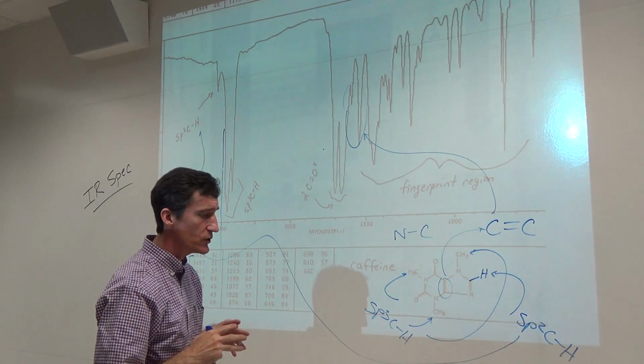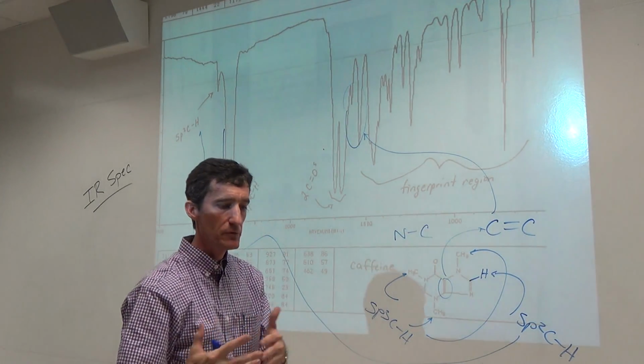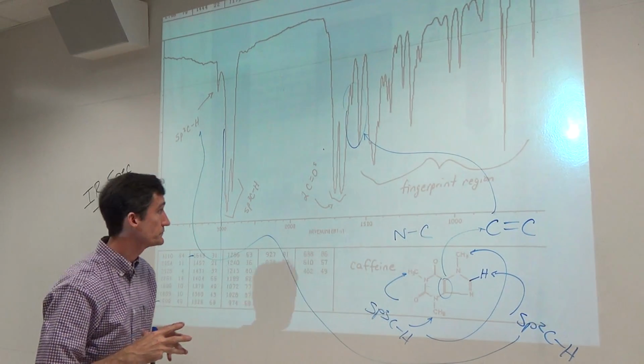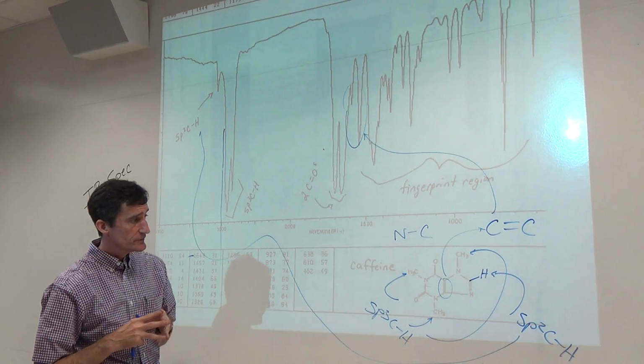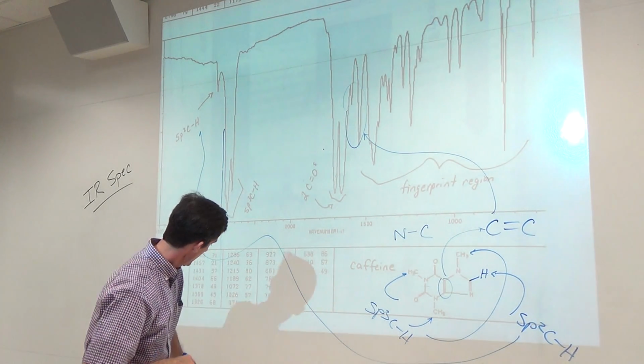One thing we do need to learn is when do you need to worry about identifying every single peak and when do you not need to worry so much. Ultimately, it comes down to what's your goal. Okay? So as we end here on this first video, let me talk about the goal. I'll erase here.